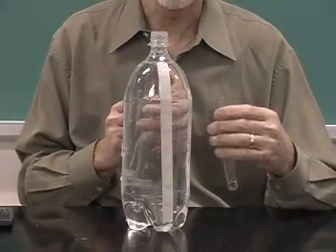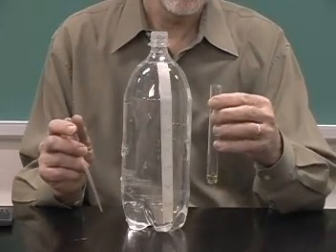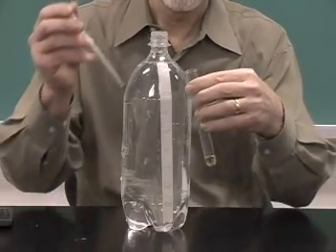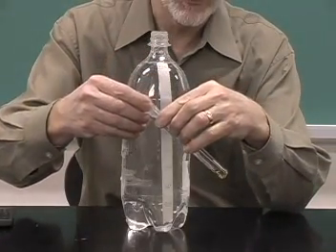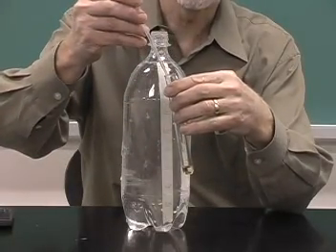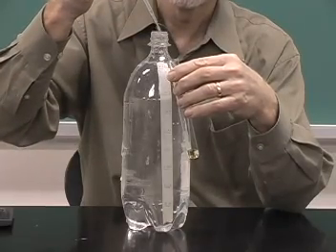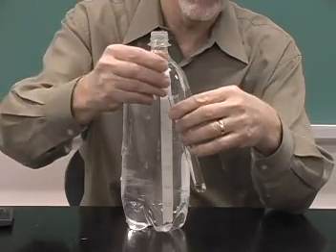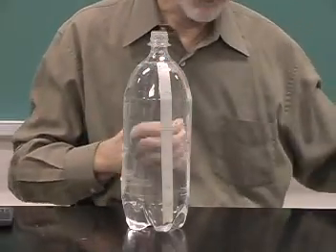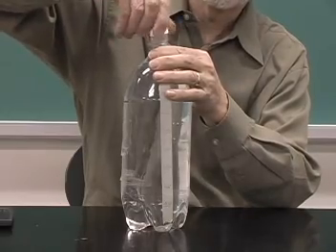Another way to illustrate the idea of very dilute solutions is to take a little bit of gasoline, put a little bit in a test tube, and take 1 drop of that and add that to a 2-liter pop bottle filled with water. So I've added 1 drop. Then we put the cap on and shake it really well.